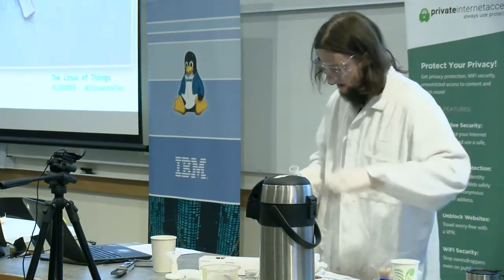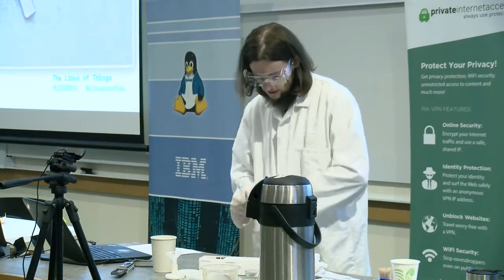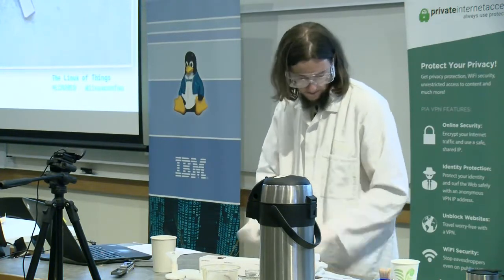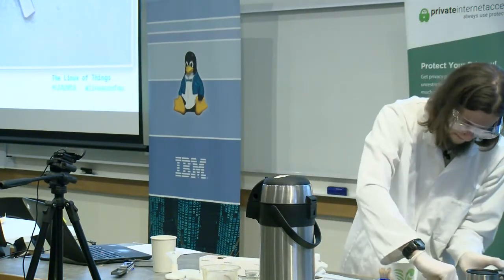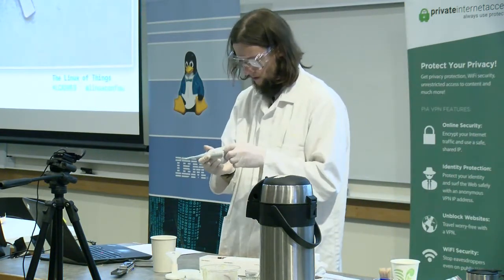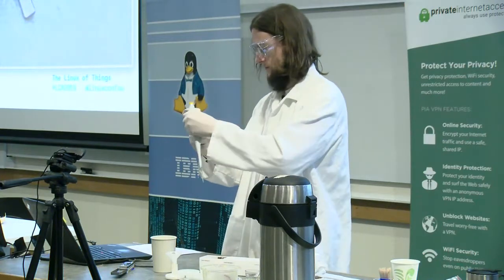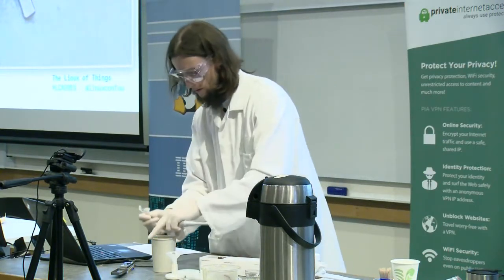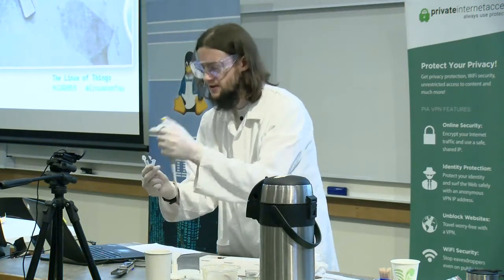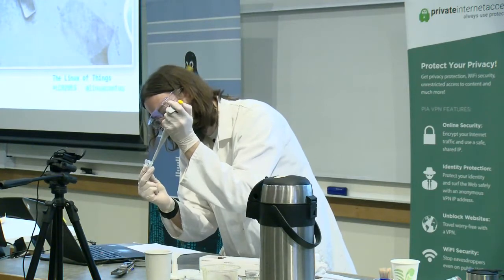I'll take 5 microliters of each and put them in a new tube. I'm assuming that they're dead enough, but if not, meh.